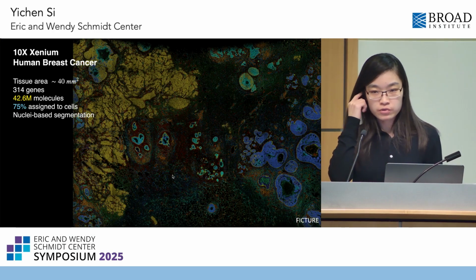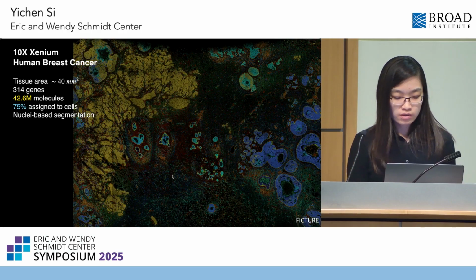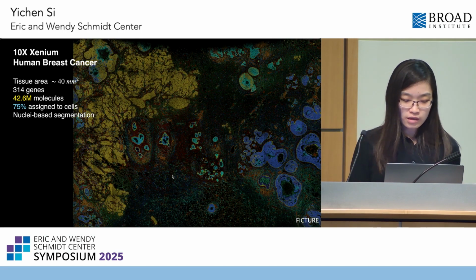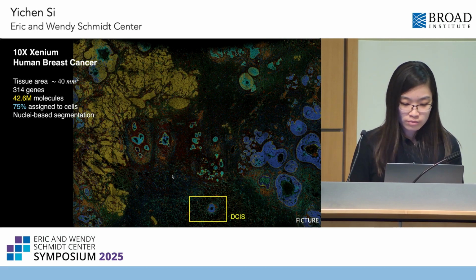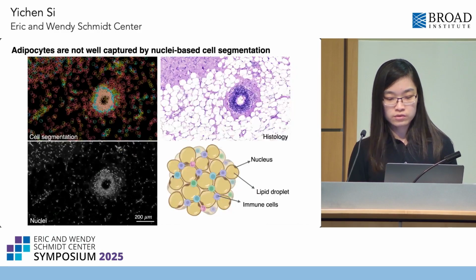Another major application of spatial omics data is cancer biology. So here is a human breast cancer tissue from 10x Xenium. The released data includes cell segmentation based on nuclei. We will zoom in on this region around the ductal carcinoma in situ.